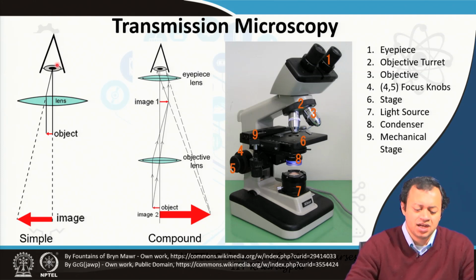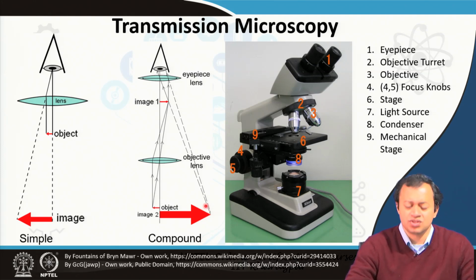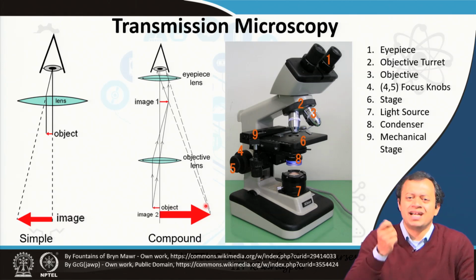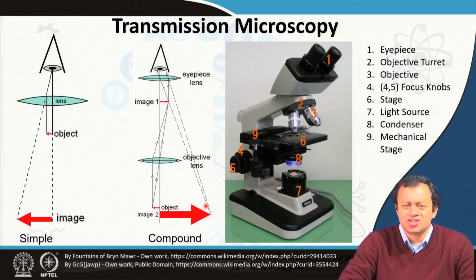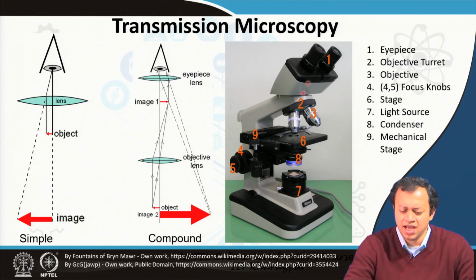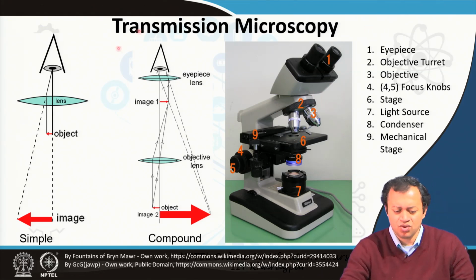Nowadays everything is further analyzed using software. It is very cheaply available, a USB controlled handheld microscope. Just try to see or dismantle it if you can get it cheaply, or if you have access to any high school or any college nearby, just go through it and just fiddle with it. I am sure you can manage. So, transmission microscopy is very simple, very common.